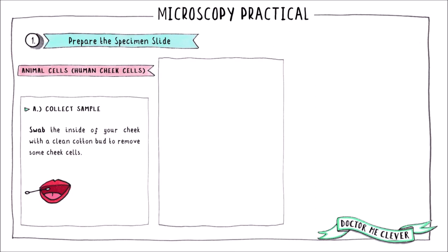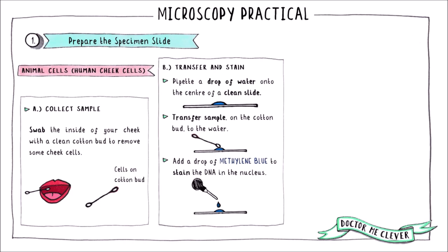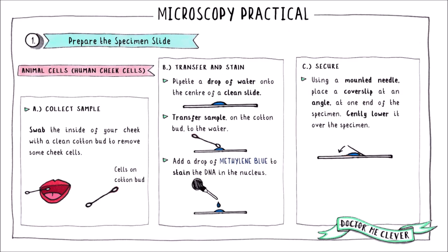You can prepare a slide of animal cells in a similar way — here I've used the example of human cheek cells. Take a clean cotton bud and swab the inside of your cheek to collect the cells. To transfer the cells to a microscope slide, rub the end of the cotton bud into a drop of water in the center of a slide. Then use a drop of methylene blue to stain the colorless cheek cells.